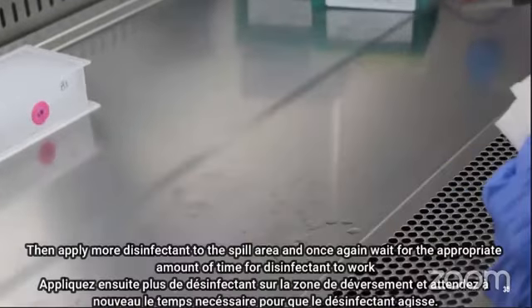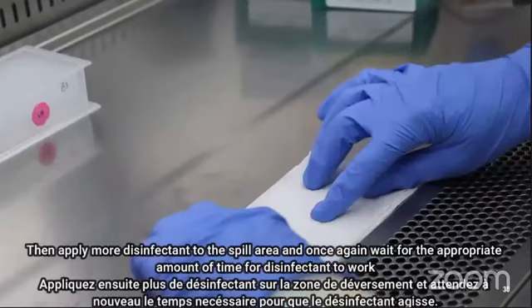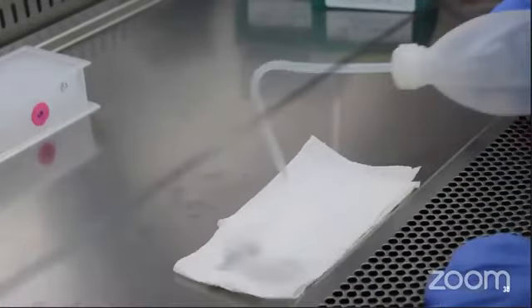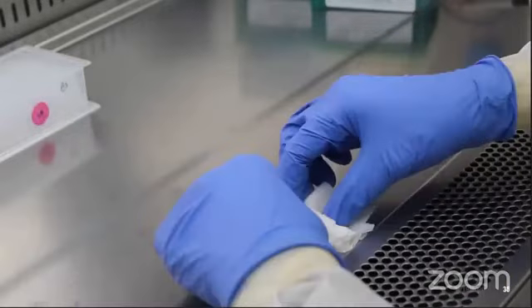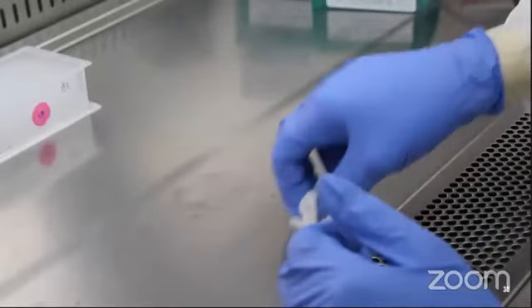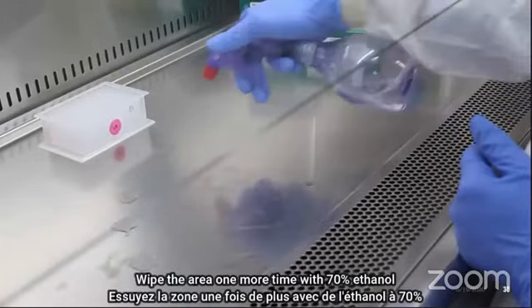Now decontaminate every item near the spill area. Then apply more disinfectant on the spill area.